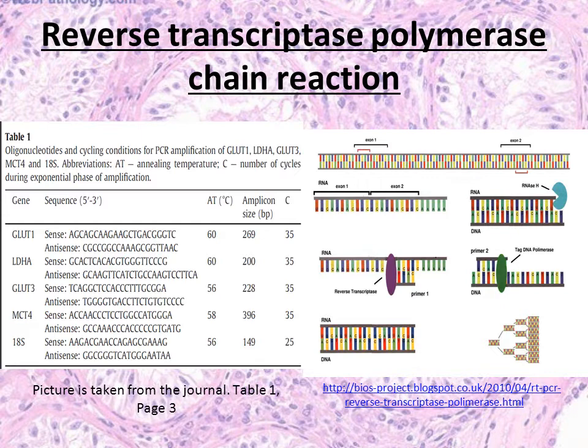RT-PCR in this experiment determines mRNA expression levels of glucose transporters GLUT1 and GLUT3. In order to determine the effects of insulin on metabolite consumption and production, as well as GLUT1 and GLUT3 expression, Sertoli cell medium was supplemented either with insulin-transferrin-sodium selenate, which is the control group, or with transferrin-sodium selenate, which is the insulin-deprived group. Treatments were performed for 48 hours. Various conditions were used for incubation, and sodium fumarate at a concentration of 2 millimolar was used as an internal reference at 6.5 parts per million in order to quantify the level of the metabolites in the solution.